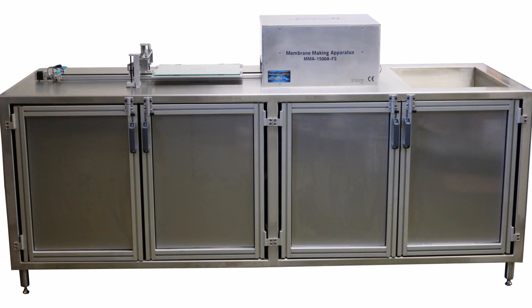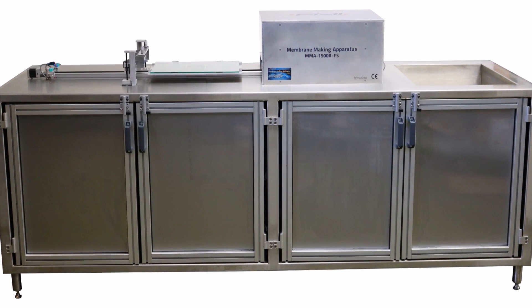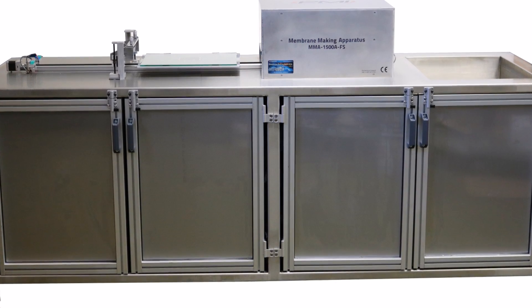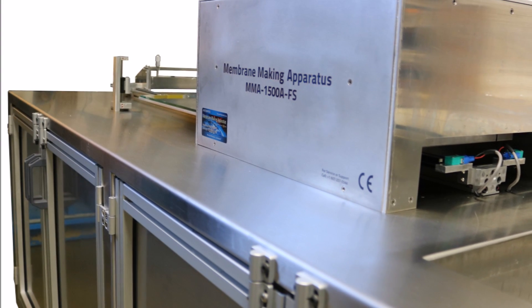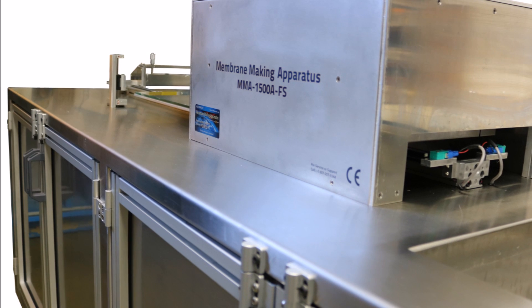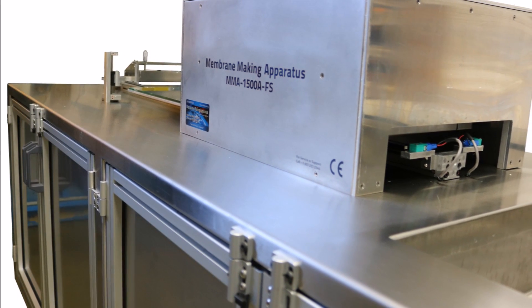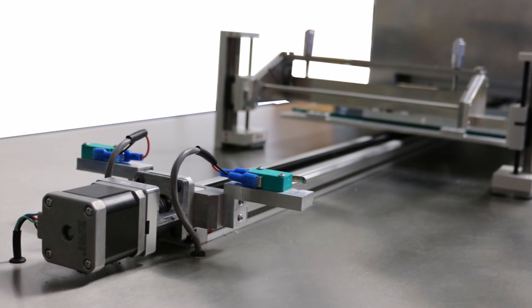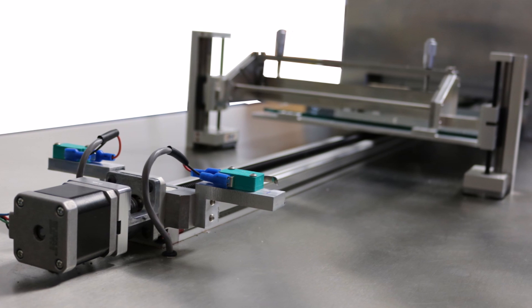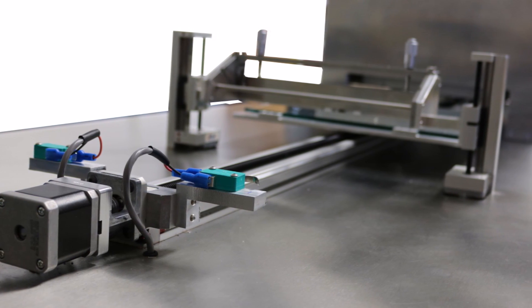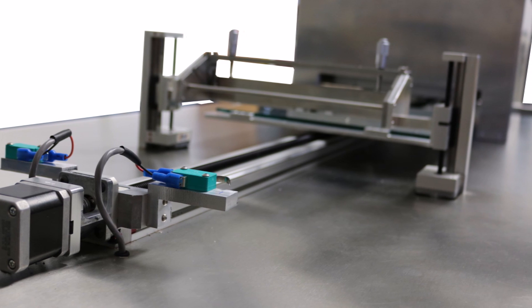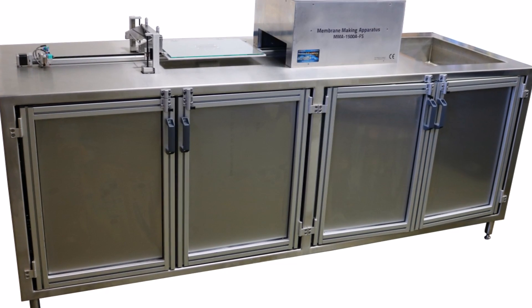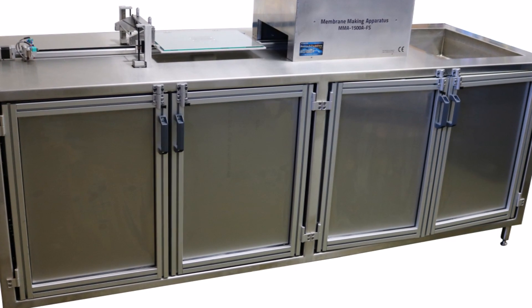Porous Materials Incorporated is proud to present the Flat Sheet Membrane Making Apparatus. This machine is capable of making flat sheet polymeric membranes from any conventional polymer at a predetermined thickness, which can be used for various research and development applications. Having been experts on porous materials and membranes for over 35 years, PMI understands the nuances of membrane making and has built this machine to provide the user with maximum control over the membrane making process while maintaining the best in the field user friendliness.